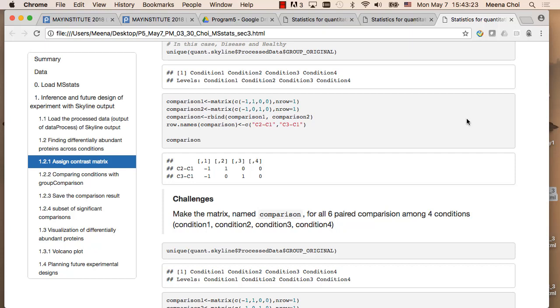Okay, blue note means yes, and yellow means no. If you get too much yellow, I will make another video. Okay. I will talk about it. Makes sense? So, the reason why this is important is when you interpret the estimate for changes, the plus or minus sign matters: whether it goes up or down depends on this plus-minus sign. Okay? Makes sense?